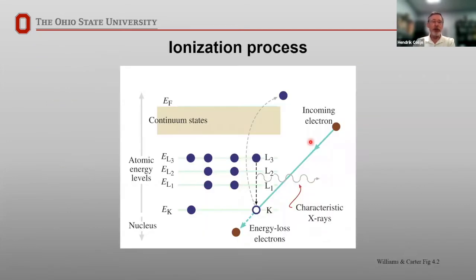So to start, this is probably something you've all seen at this point. X-ray analysis here with an electron beam. Basically, you have an incoming electron that will ionize an atom. So in this case, they're showing a K-shell ionization. You knock a K-shell electron out of the atom, and now you have the atom in an excited state. So one of these electrons in an outer shell will drop down to fill that vacancy in the K shell, in this case.